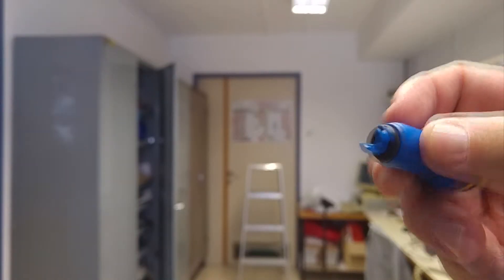We have been having trouble lately with some of our NMR spinners breaking, so I thought we'd try a drop test on a broken spinner to see just how well they stand up.